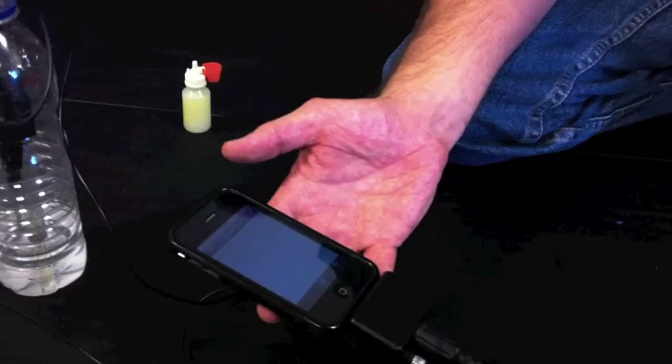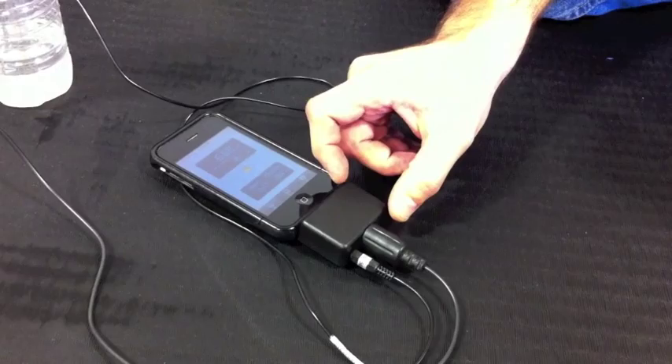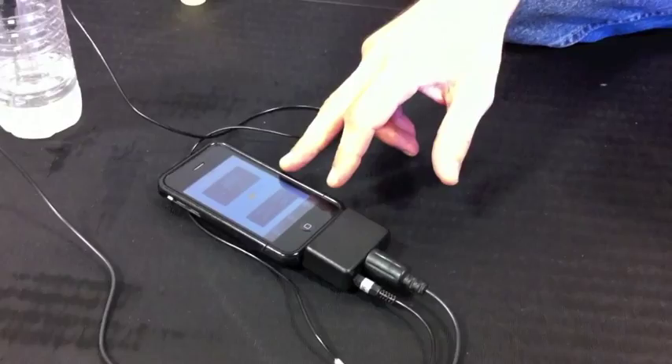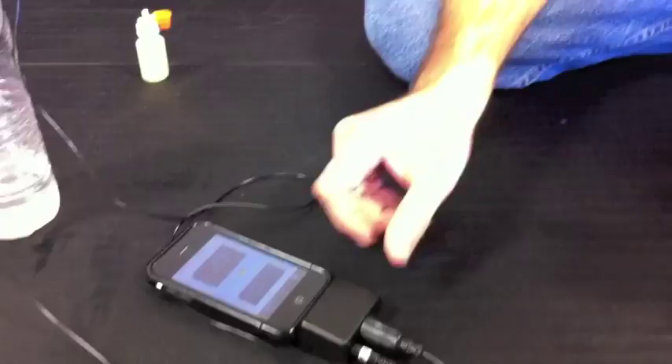One thing also that makes this device different from other PH instruments on the market: there's no battery or power source in the interface itself — it's all powered by the iPhone. So there's no question of having to separately charge up your instrument or get batteries for it. I designed this because I have a well and a pond on my property, and all of a sudden water started to become very important to me. I knew that if I had an instrument that needed separate batteries, I'd never charge them. Every time I wanted to use it, I'd either be charging it or trying to find batteries. I wanted something that I could just pick up, plug into my iPhone, go out to the pond, check the water, and come back in — that's where the idea for this came from.